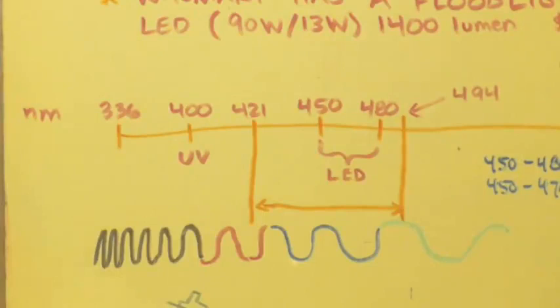It's blue light. Why is it great? Because it's only blue light, and that's it. When you do a free radical chlorination like this, a benzyl one, you need to turn off all the other lights and block out the sun. If you have any windows, curtain them up. If you have an overhead light or any other fluorescent lights or incandescent lights or any kind of lights, turn them all off because they are producing small amounts of UV and violet light.